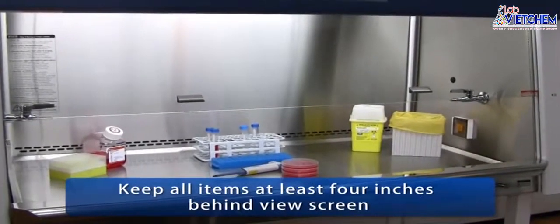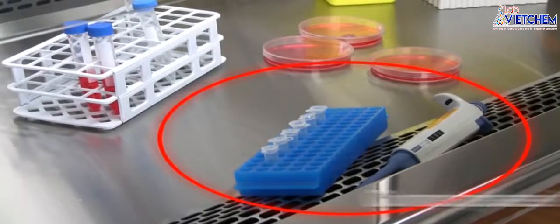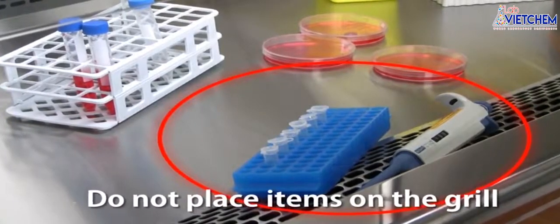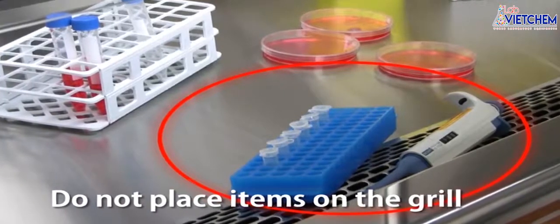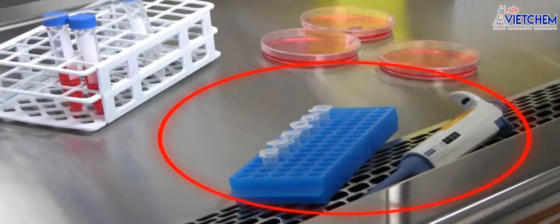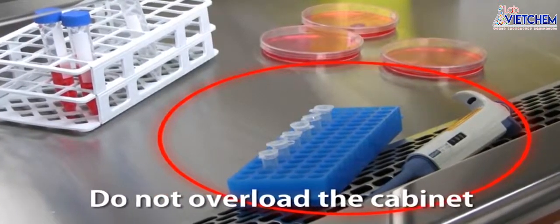Nothing should be taken out of or put in the biosafety cabinet once you've begun working. Pay special attention to the front air grill, which must not be covered as illustrated here. Disruption to the inflow of air into the cabinet will compromise the cabinet performance. The cabinet work zone should not be overloaded.